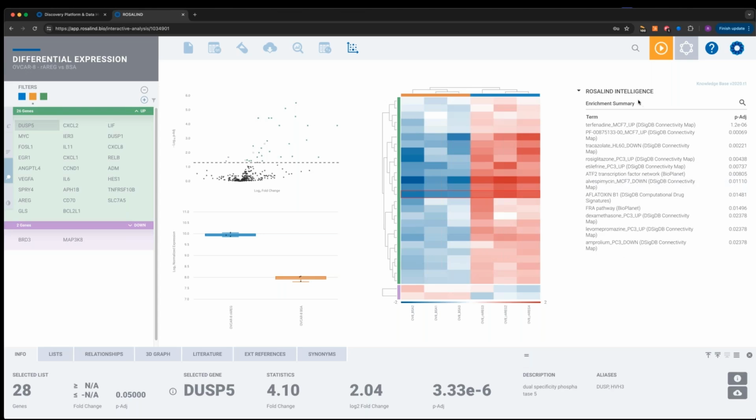What we're seeing here in this enrichment summary is the result of that analysis. We've clustered all thousands of terms, we've removed redundancies, we've figured out the most representative terms and pathways across all those clusters, and those are brought to the forefront here in the summary. In my recommendation, this is the place to start, because these are meant to represent everything else, all 1,000 terms plus in all of our databases. If I were going to do this analysis on my own, I would start with this enrichment summary and look through these.